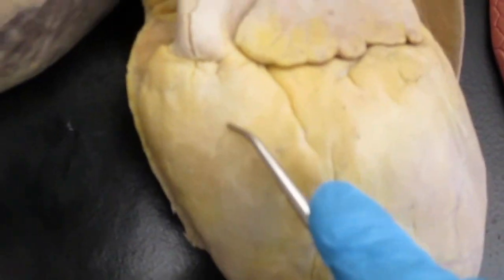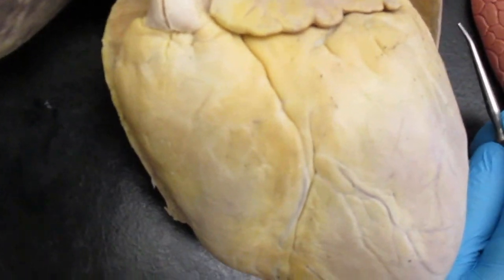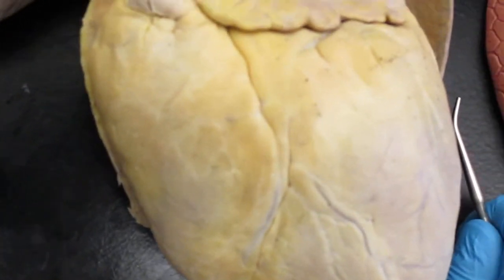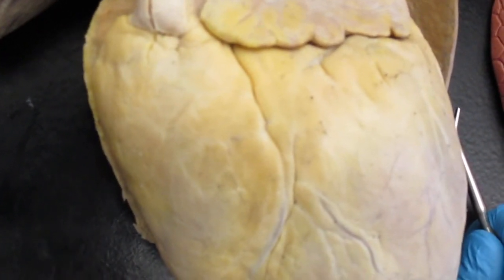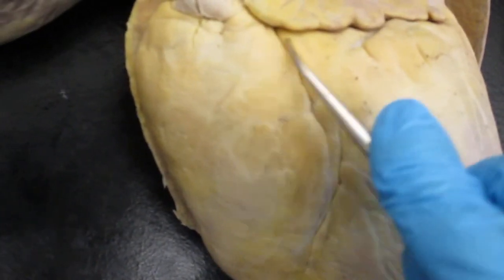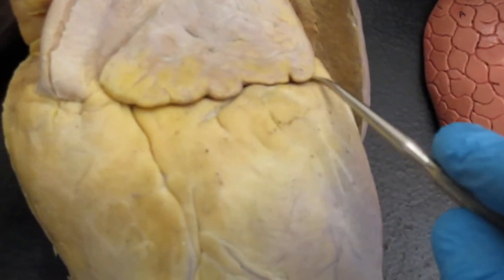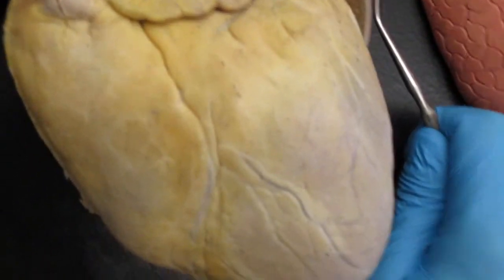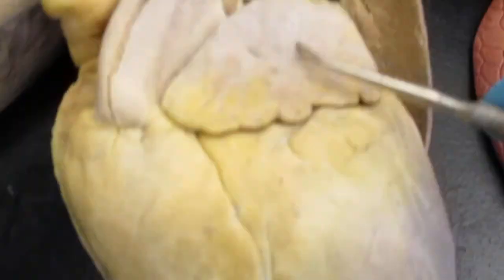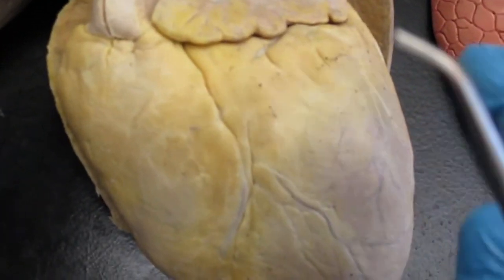We have this important structure here. This is your anterior interventricular sulcus, and that's where you have the anterior interventricular branch of your left coronary artery running right down through here. And then this right here is your circumflex branch of your left coronary artery. This is the apex of the heart. So you have your auricles here, and on the other side you have your ventricles here and here.